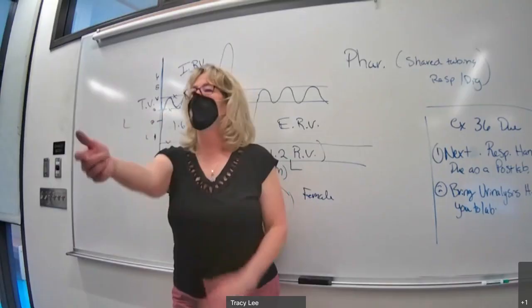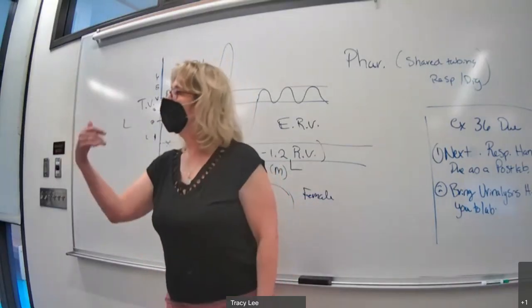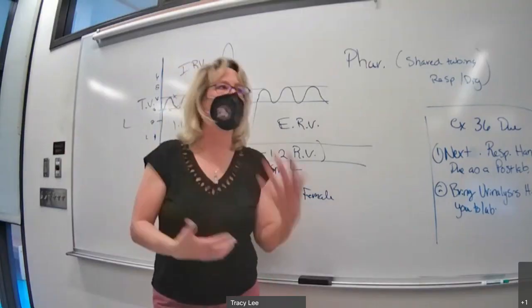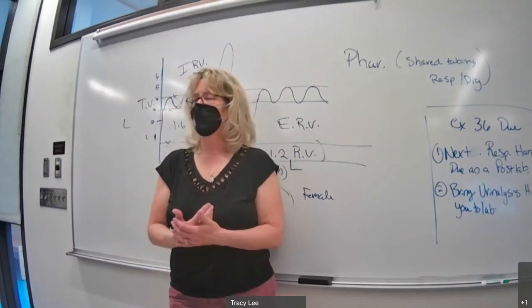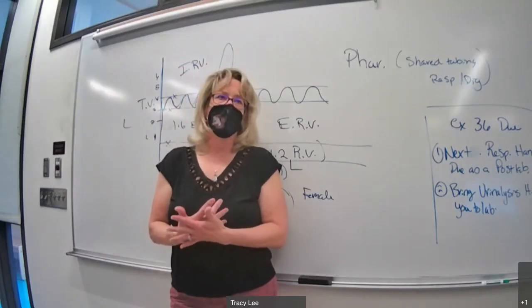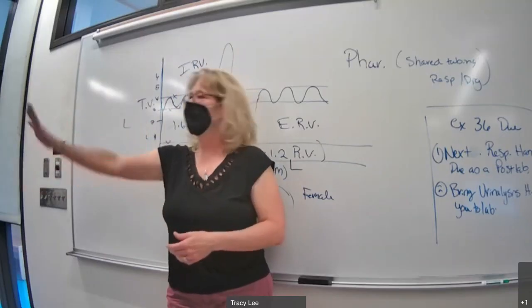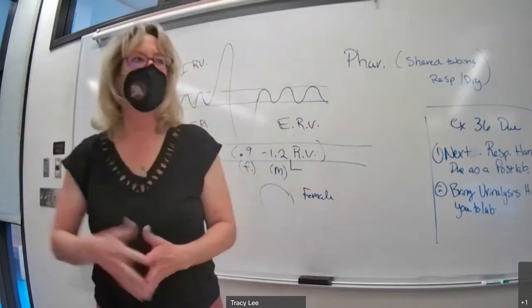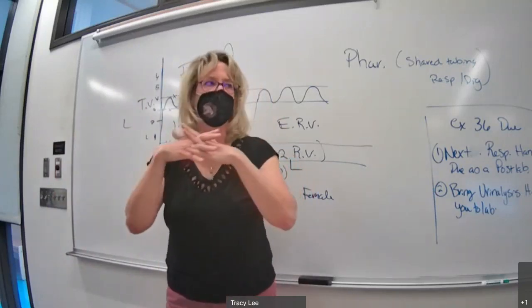So a little bit of damage, but it is damage. What's the damage come from? Foreign objects, right? Dust, dirt, particles that we breathe in. So what kind of cell structures would protect us from that? Well, that's immune system. You're not wrong, but just tissue type. What's a protective tissue thing?